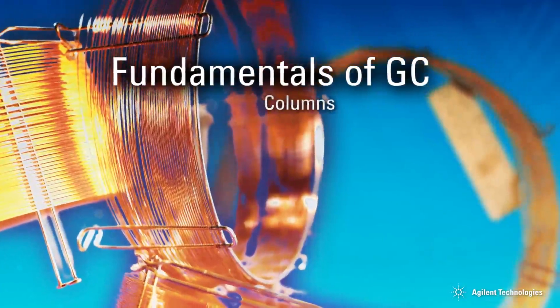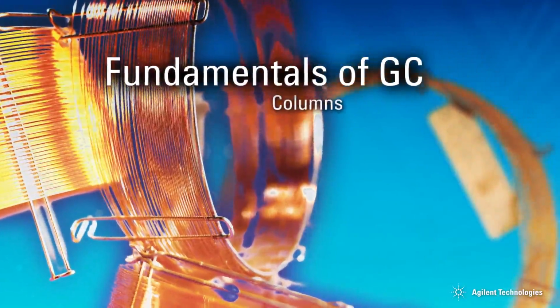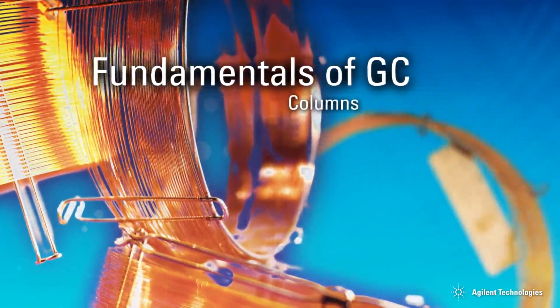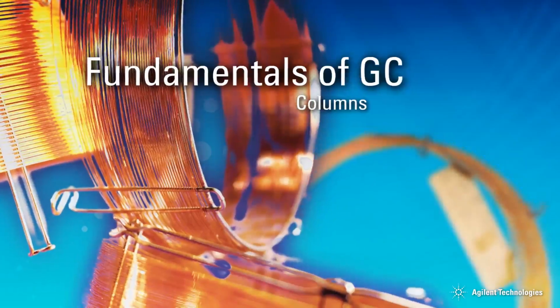Welcome to Fundamentals of Gas Chromatography Training. In this module, we will explore the theory of GC columns and separation.